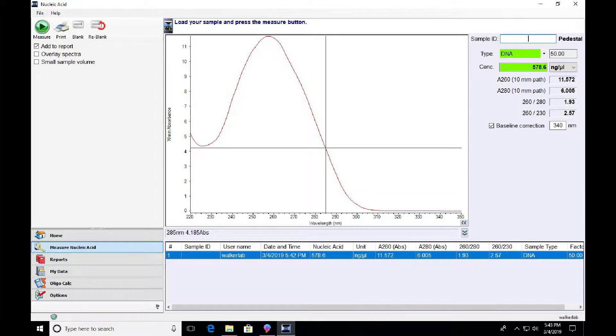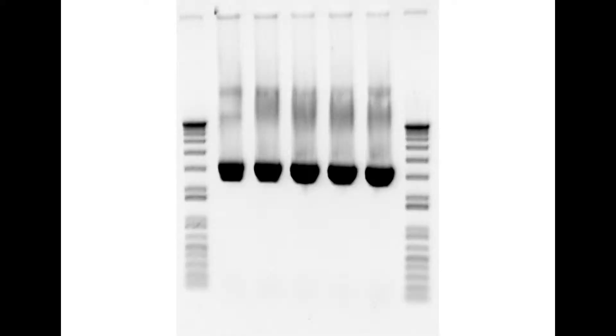This is what your DNA quality will look like from this procedure on a nanodrop. You can see that I got 578 nanograms per microliter in a total of 75 microliters, making it a 43 microgram yield for this plasmid prep from 1.7 ml culture. And on a gel, if I load about 500 nanograms or one microliter of that DNA, this is what the DNA looks like. Very strong thick plasmid band and not too much other stuff.